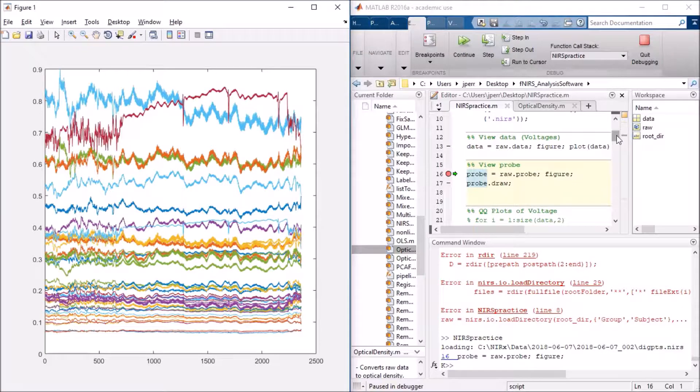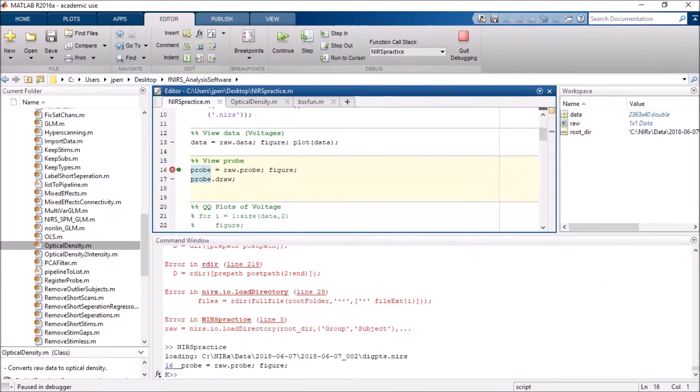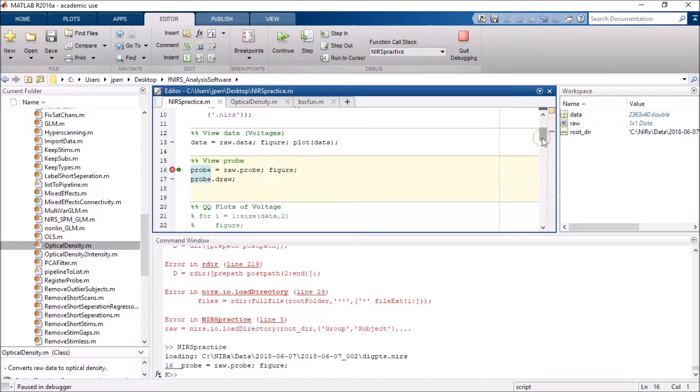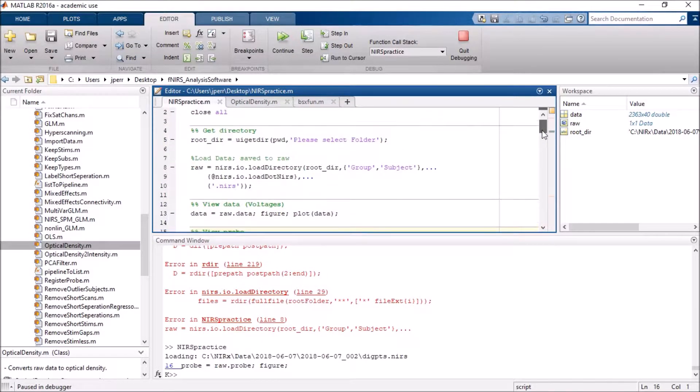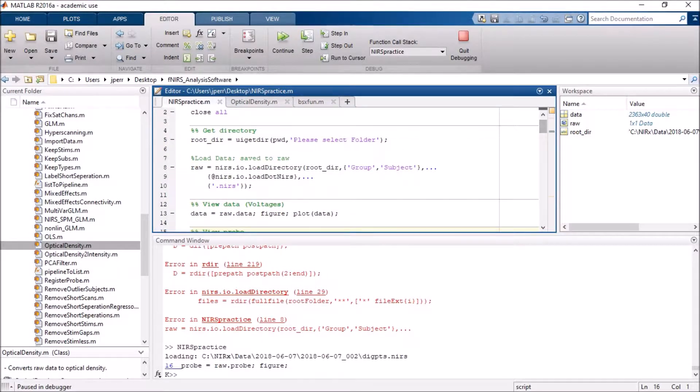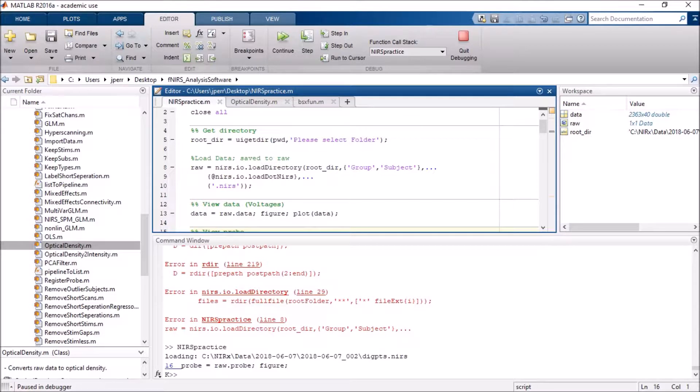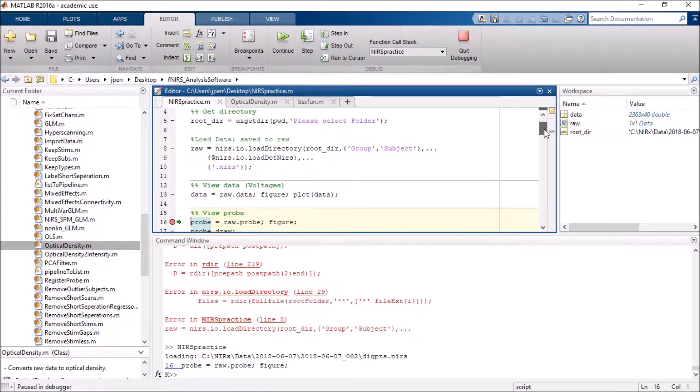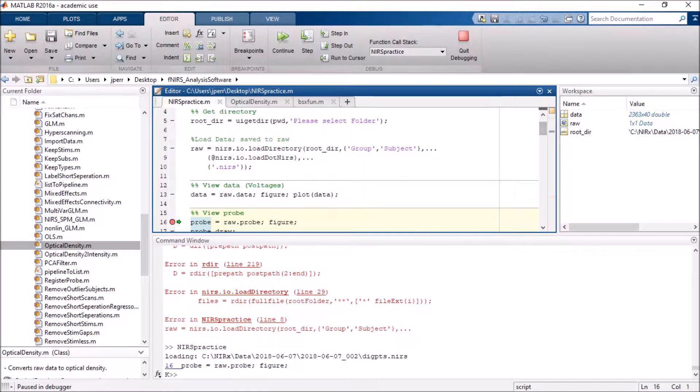So I've put together a fairly brief script just covering a very, very simple pipeline for the toolbox. Basically I declare my root directory, I load my data using the load directory function in the toolbox. I've also designated that I'm loading a .nears file.